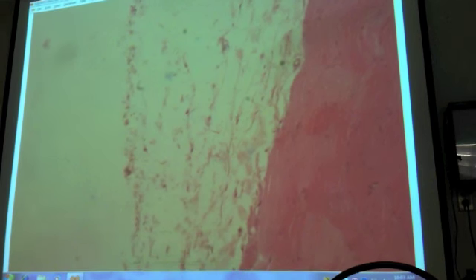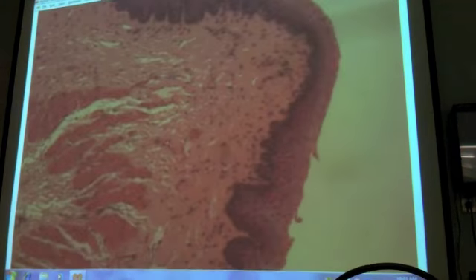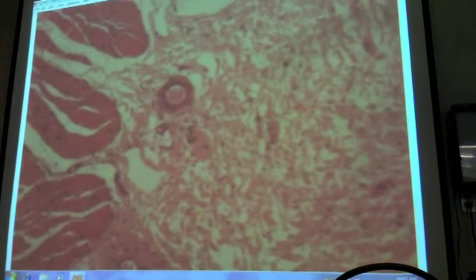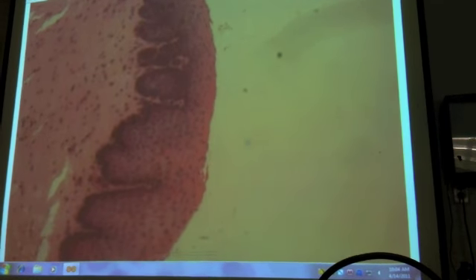So I'm gonna go back and look for another section. Let's look here. We're on the same slide, so we're in the same organ.